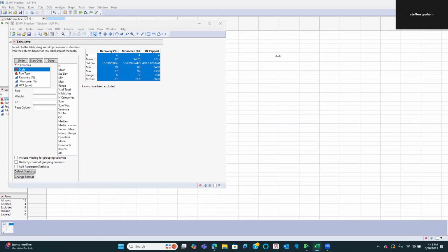So I'm using 3 times standard deviation. I mentioned this before that, if you're doing qualification, you're defining that beforehand. You don't have to use 3 times the standard deviation. Maybe use 2. Maybe you use your equipment capability for detection. It could be whatever, but you define that beforehand in qualification, most certainly.